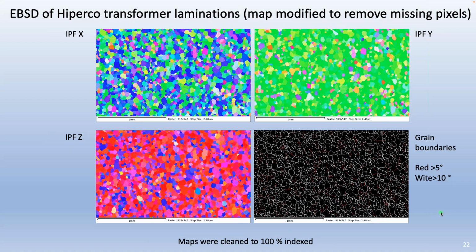If you're starting to see just random indexing of the carbides as one or the other, you begin to become suspicious that there's a problem. So that might be a great case, if you knew that there was a compositional difference, to use EDS to help determine which phase you index it as. I think that would be very helpful. I think at certain points, the Hough transform is no longer capable of differentiating two cubic phases like that. And I think that might be a great application of the dictionary indexing approach, because I know, having looked at those patterns from those two carbides, they are very different looking to the eye, but the Hough transform won't pick up on that.